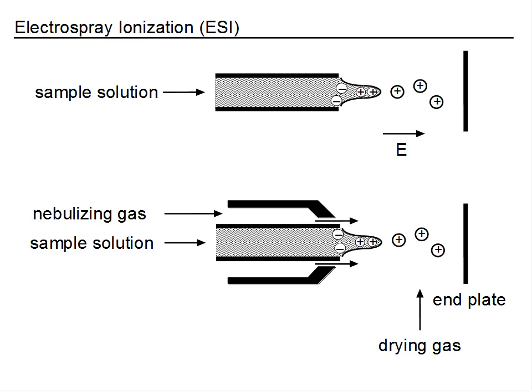For certain solutions, and especially at higher flow rate, it is necessary to help this ionization process with a nebulizing gas which flows parallel to the stream of liquid. This nebulizing gas essentially makes a jet and then helps the ionization and also the evaporation of the solvent.